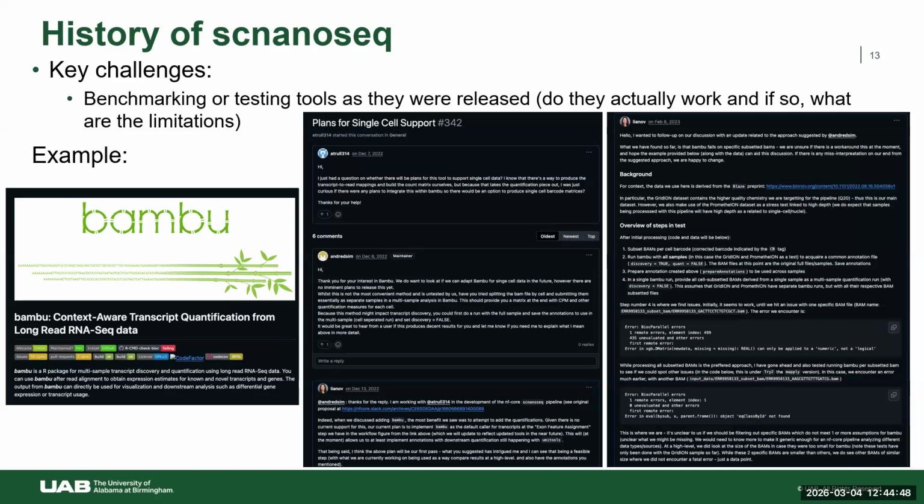So we actually spent a lot of time taking their method and testing this in our single cell data to see if we could get robust results and to see if we could get scalable results as well. To make the long story short, we were not able to. It was a clear limitation of the tool, but instead of keeping that information to ourselves, we went ahead and replied to the authors with everything that they needed to be able to do more work on this.